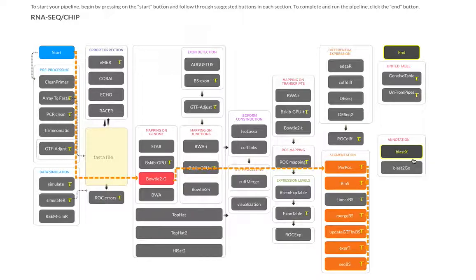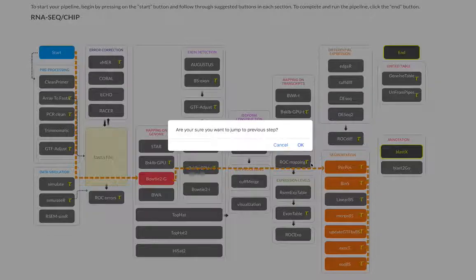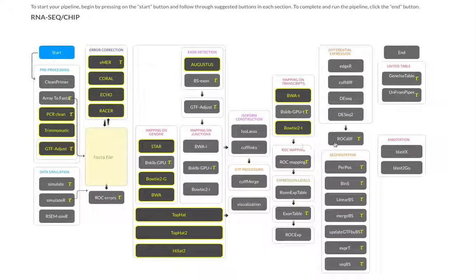Now this is a very complicated process. It will require a very specific situation, so that's why we're not really going into detail about the segmentation and annotation parts. Now another thing that you will notice here is that all of these files, the pre-processing files, are essentially going to work with a lot of your options right here. And that's very important so that you know that for every type of pipeline that you do, you can add some of these.